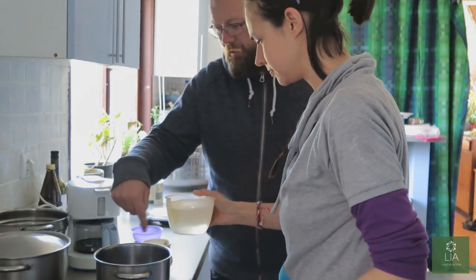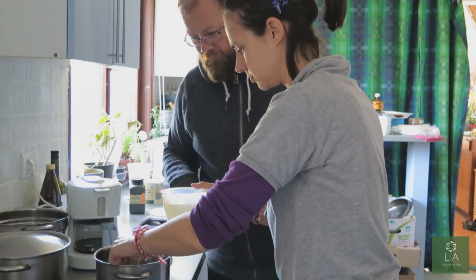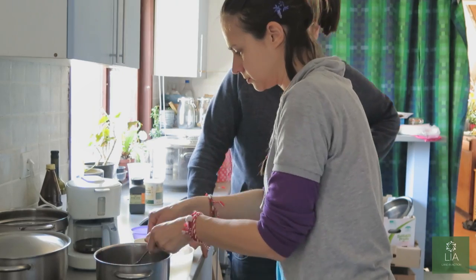A spoon or something. So just mix it in like you would. You don't want any lumps in it. You just want to make a nice smooth paste, and then add the rest of the water.